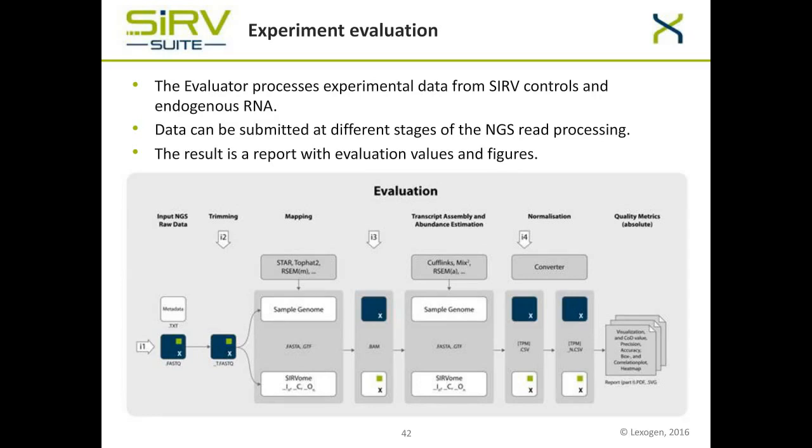So now that we have quantified our transcripts, we have to do a normalization step.